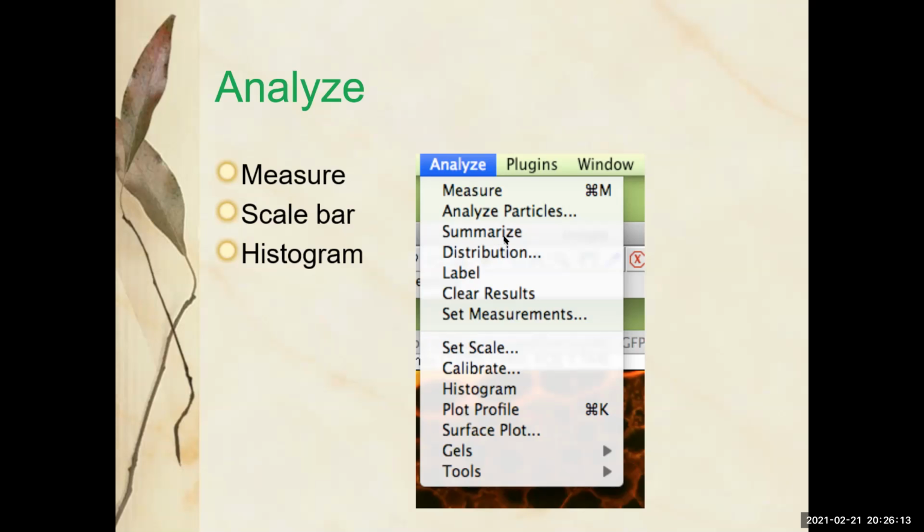We're going to talk about analyzing your data a little bit more honestly next semester, but oh yeah, there's the histogram. You can find things in multiple places in most imaging software. A scale bar. Scale bars are great if you have done what's known as calibrating your scope.